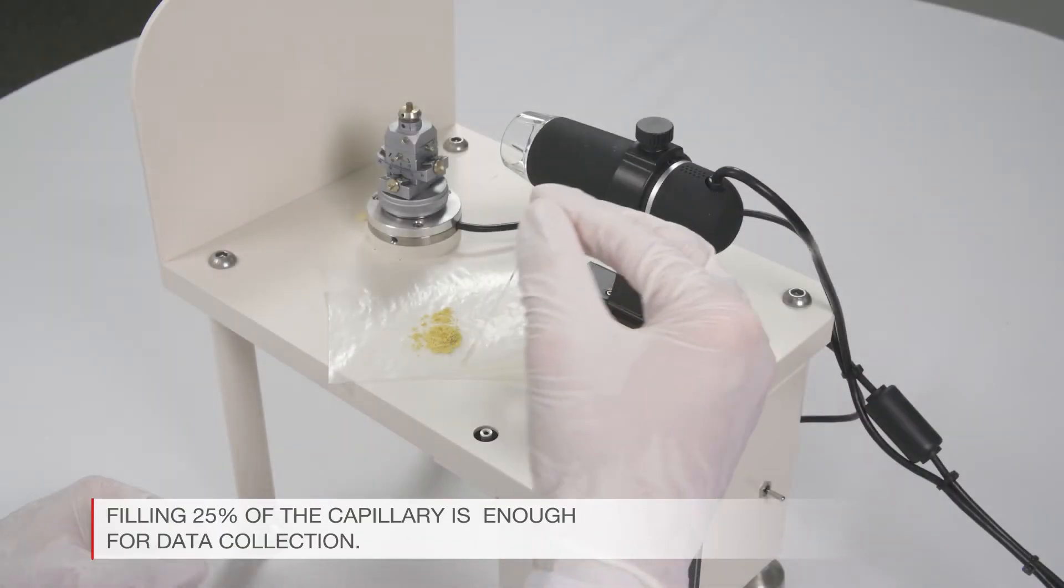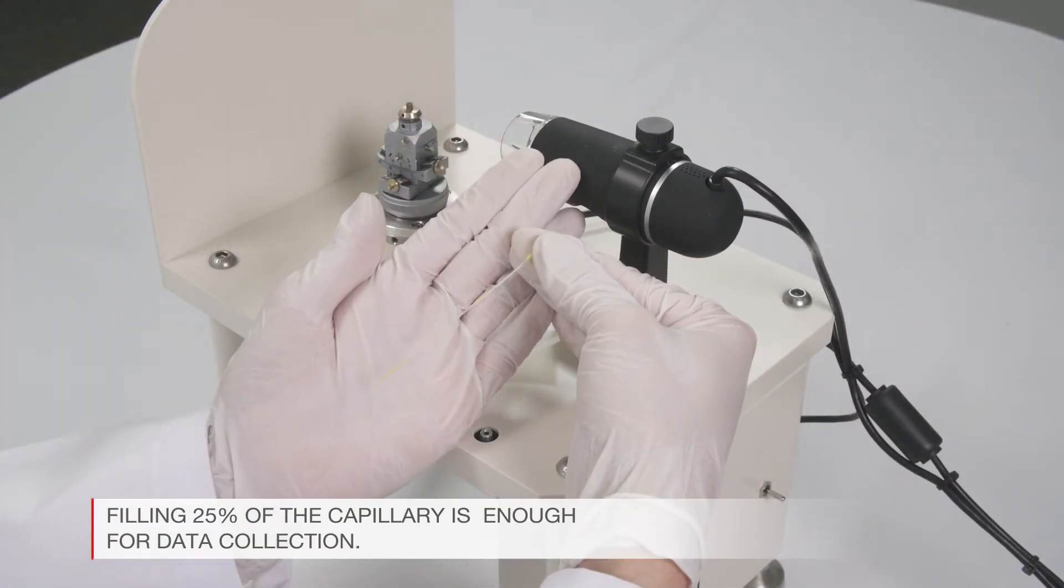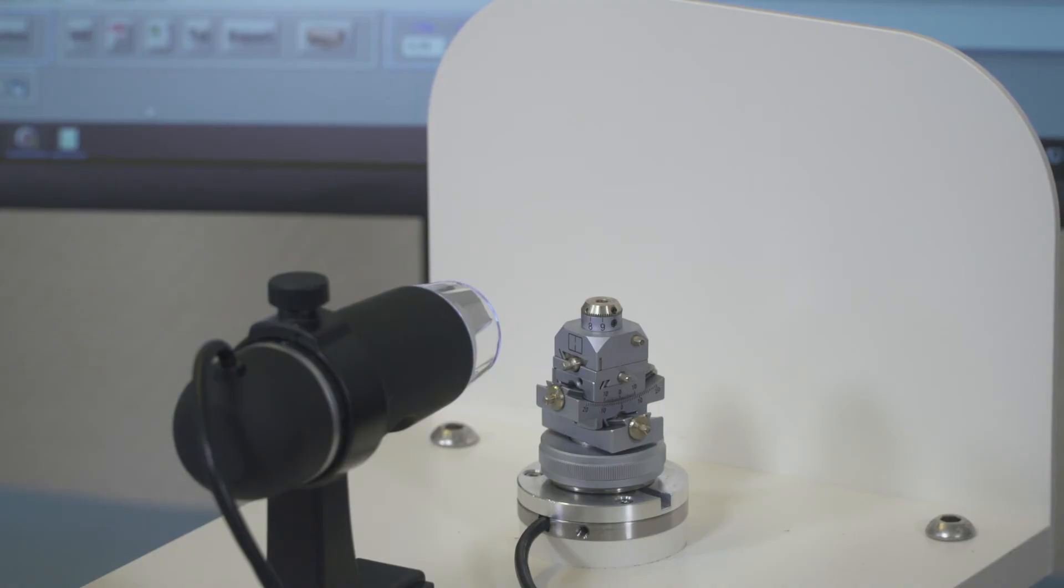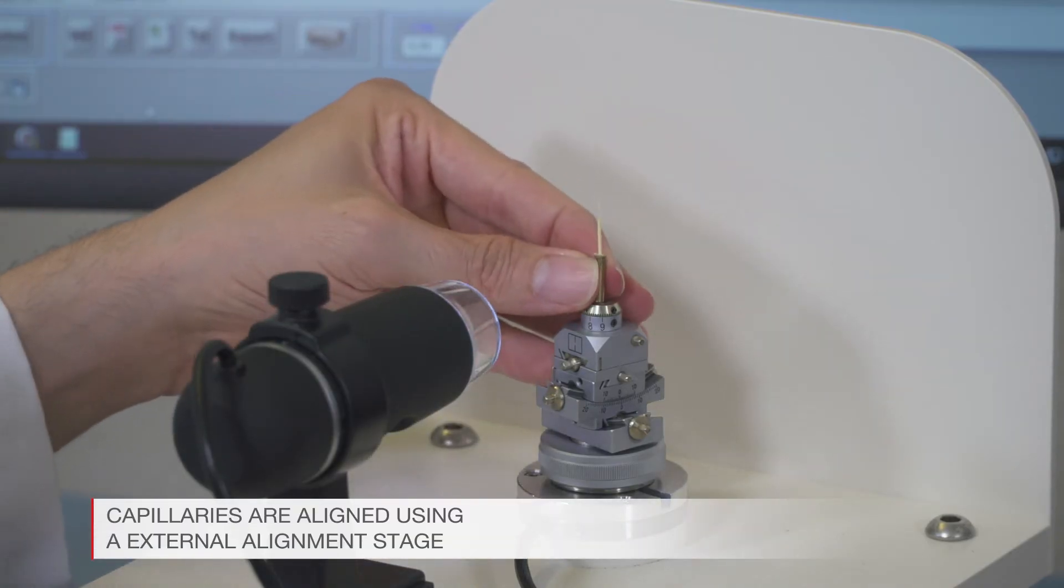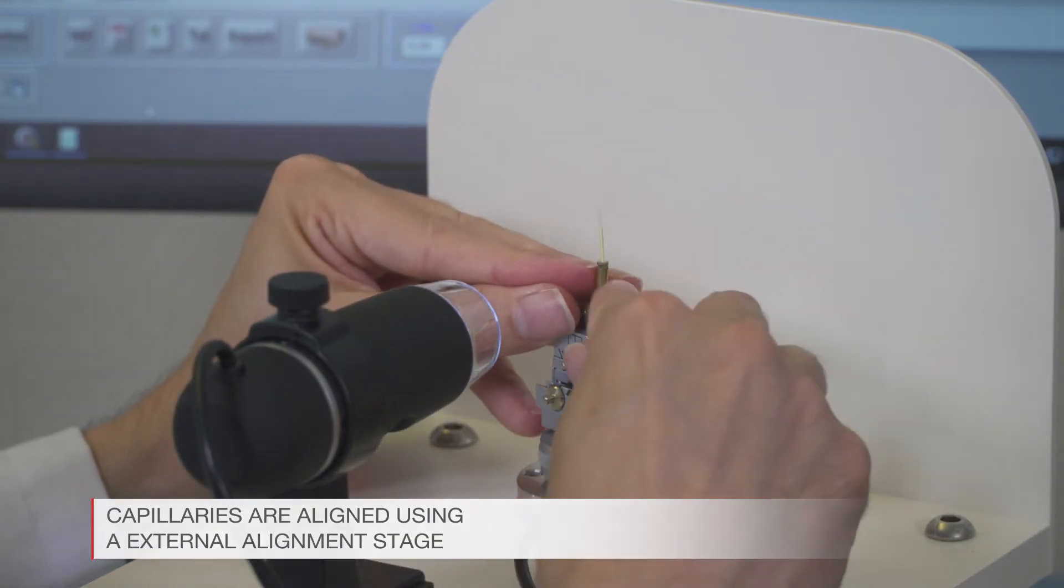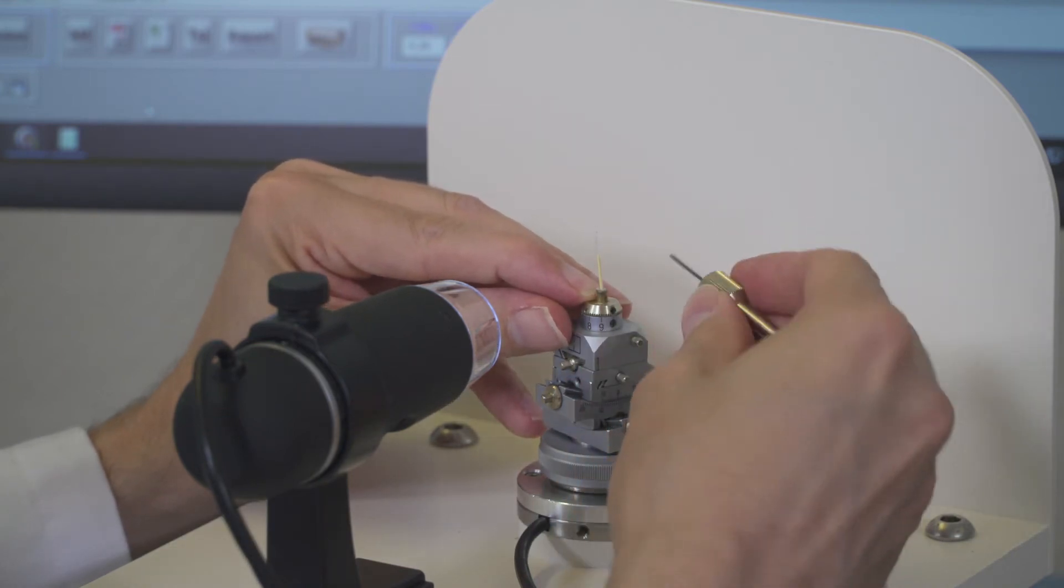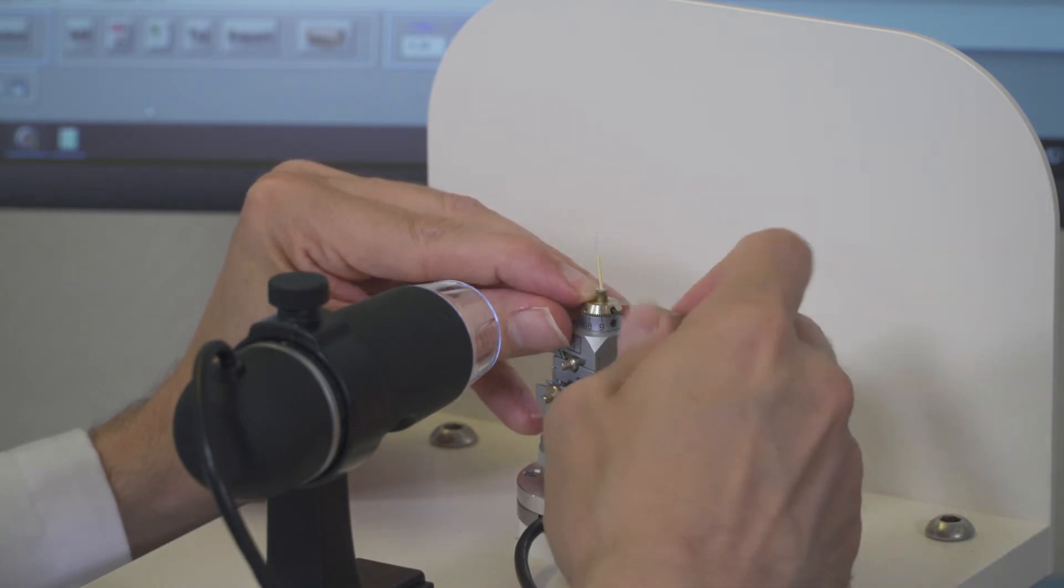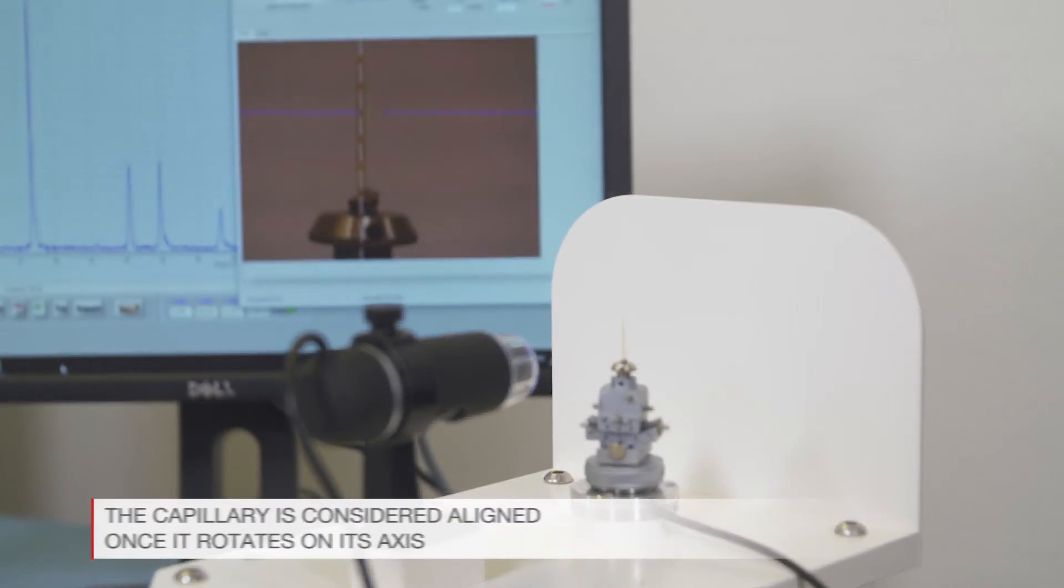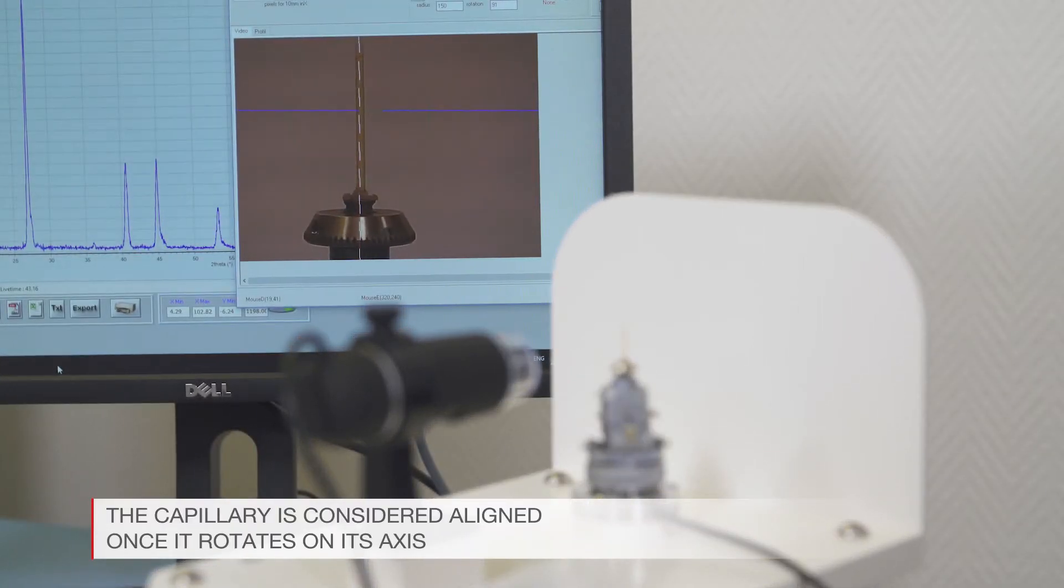Filling 25% of the capillary is enough for data collection. Capillaries are aligned using a goniometer head on an external alignment stage, using a video microscope interfaced with a computer. The capillary is considered aligned once it rotates on its axis.